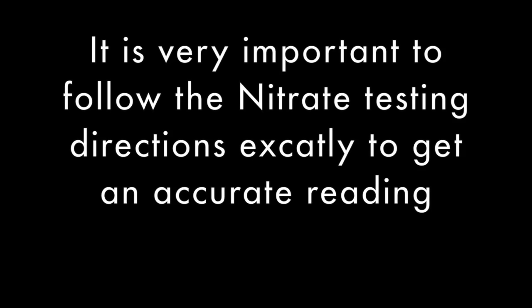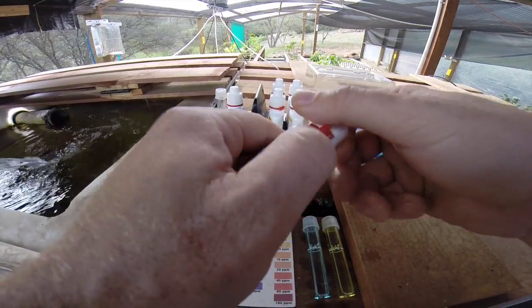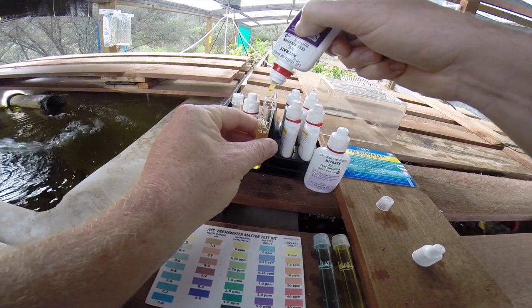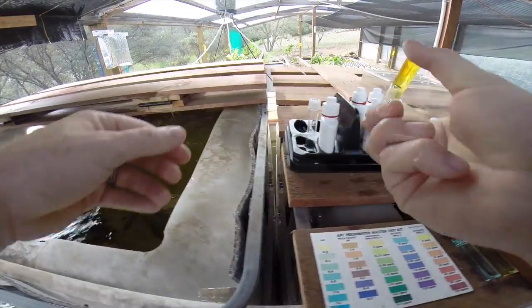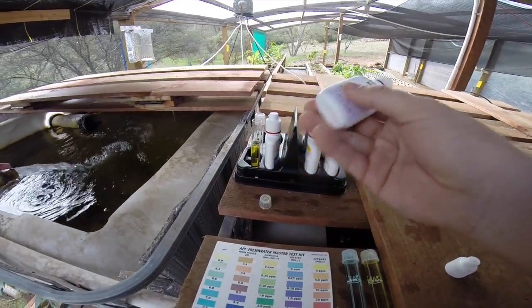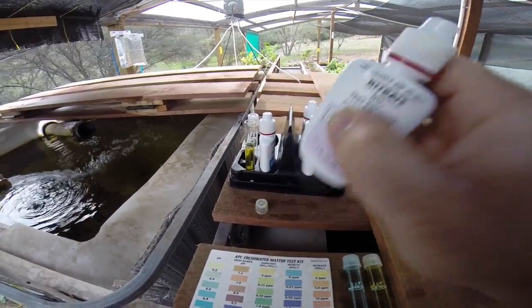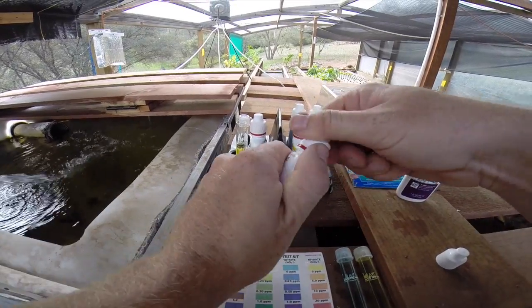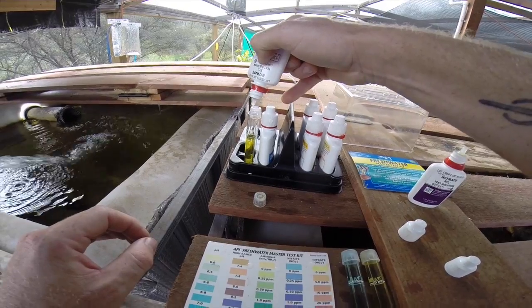Now we'll test the nitrates, but you have to follow the directions exactly. Take a filled test tube and add 10 drops of nitrate test solution bottle number 1. Cap the tube and invert several times. Now take nitrate bottle number 2 and shake vigorously for at least 30 seconds. Then add 10 drops from bottle number 2, cap the test tube, and shake vigorously for 1 minute.